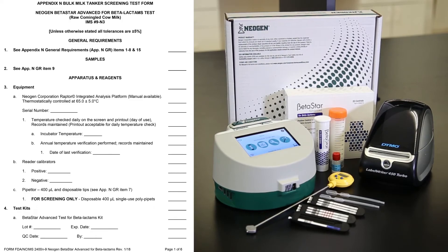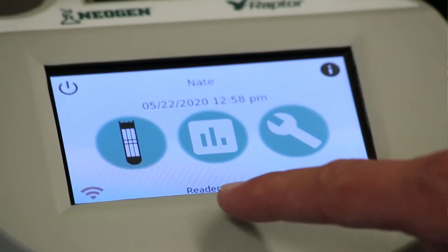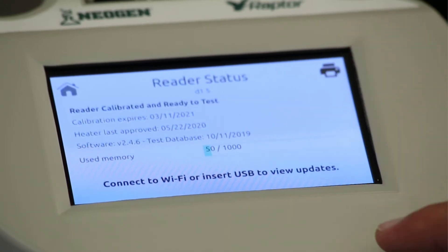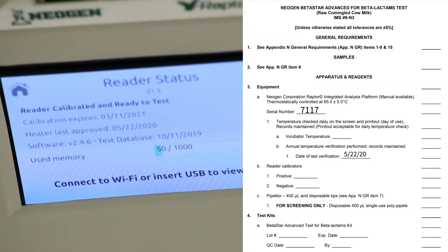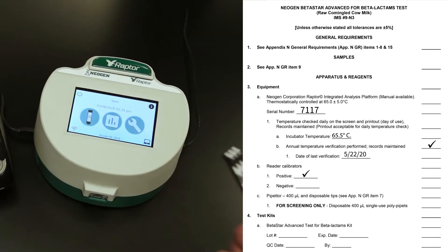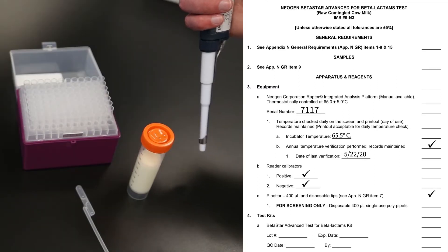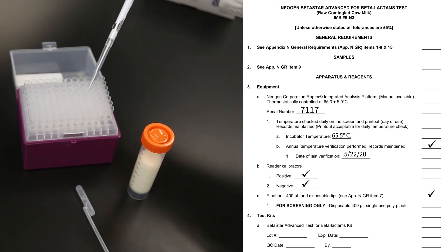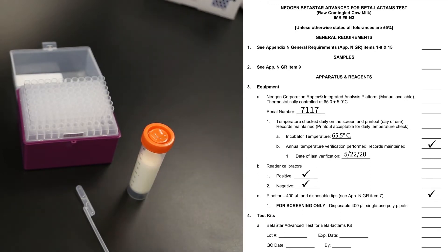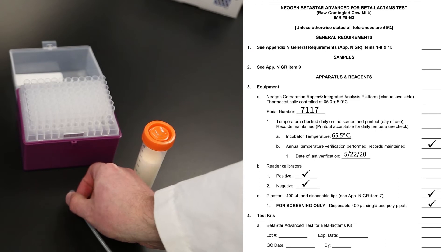The next section details all required equipment and reagents needed to perform the test, beginning with equipment in Section 3. Record your Raptor's serial number and the date of last temperature verification — this information can be found either on the home screen or within advanced settings under diagnostics. Incubator temperature will be recorded and printed during each analysis, which is acceptable for daily temperature check. Positive and negative reader calibrators are used as part of the daily performance check. A 400 µL pipetter with disposable tips must be used to dispense the milk sample for confirmation labs, or the included poly pipettes for screening labs.